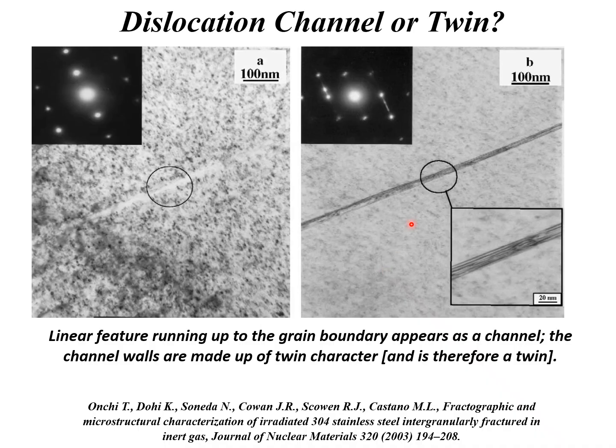a TEM. They might look at that and say, well, we don't have any radiation damage there, but there's actually lots. Or they might look at that and say, oh, look, there's a channel cutting through the radiation damage. It's not really, it's a twin. Now that twin may have formed after radiation during mechanical testing, or it could have been there to begin with. And basically, if it was there to begin with, either way, you'd have damage within this twin. But in this particular case, it's obscured by the strong diffraction contrast of the twin.